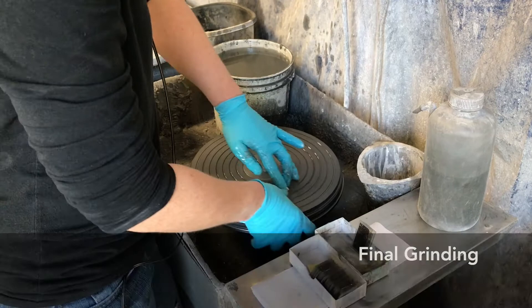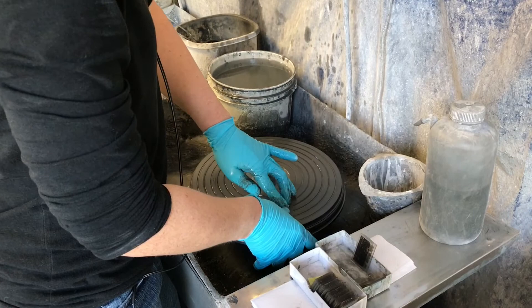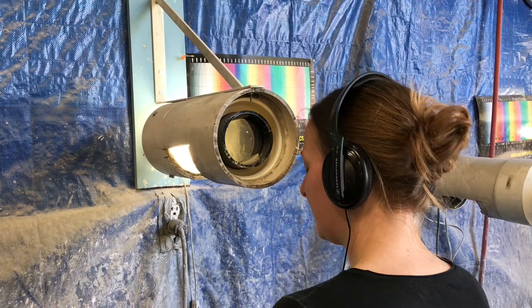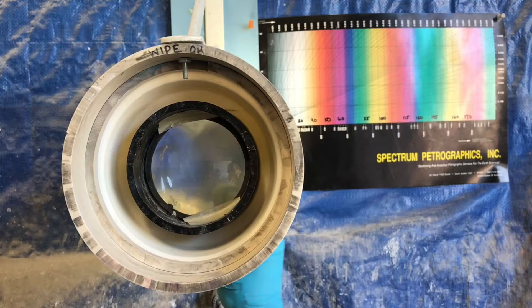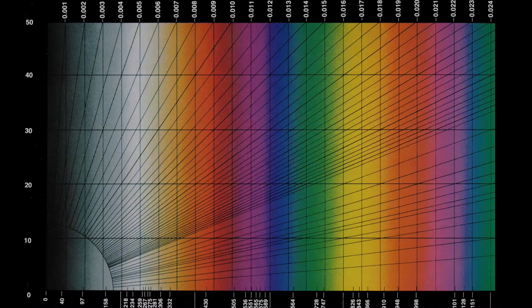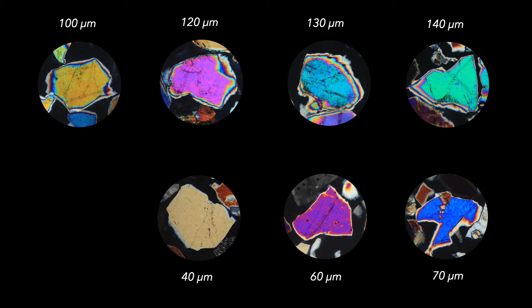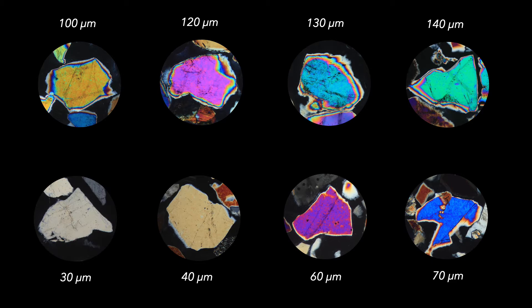While the Hillquist has a gauge that measures apparent thickness, the final grinding step requires the precise skill of the technician. This station is similar to the surfacing mud wheel — a mixture of 18-micron grit and anhydrous liquid is applied to a grooved lap. Using varying pressure and fine-tuned tactile sensitivity, the technician carefully grinds the slide while repeatedly checking thickness in a cross-polarized viewer. This is where the quartz rim created during embedding comes in handy. Quartz grains display different interference colors at different thicknesses, and under cross-polarized light these colors shift in a predictable way as the slide is thinned. A slide that will be polished is ground to 40 microns where quartz is lemon yellow; standard final thickness is 30 microns where quartz appears bright white.